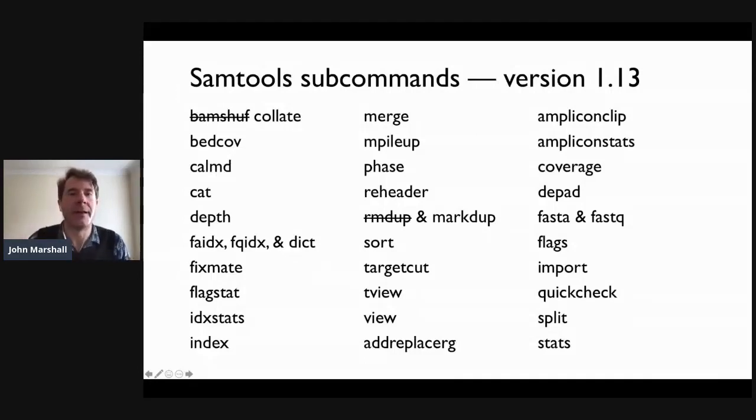It's a cheap unsorting tool. It brings reads together. So it's kind of like a cheap form of sorting by read name.